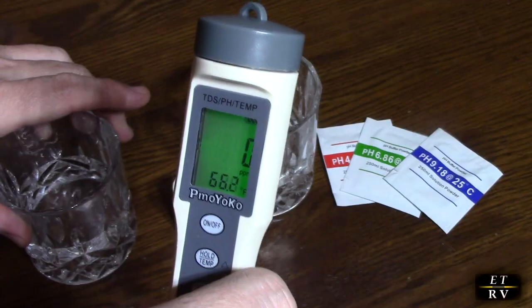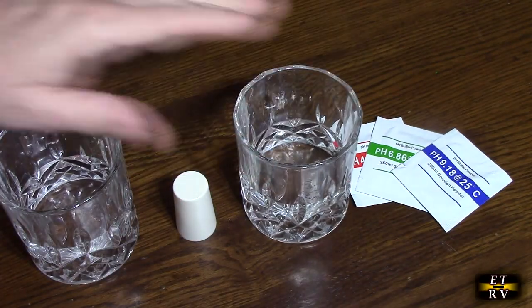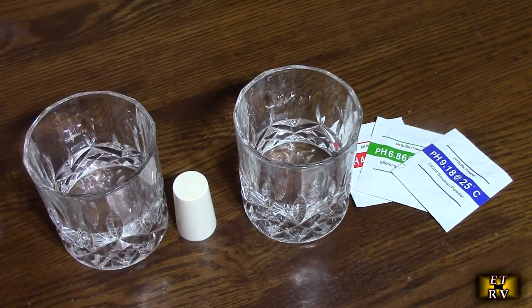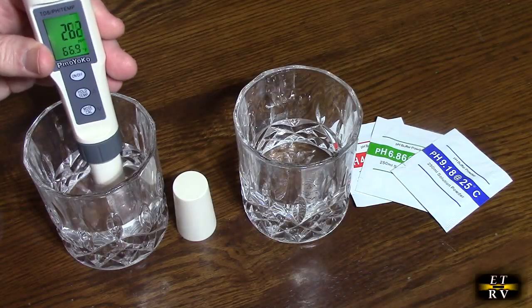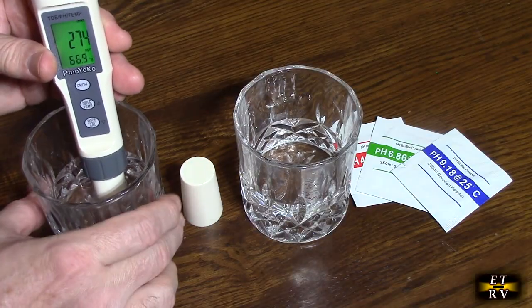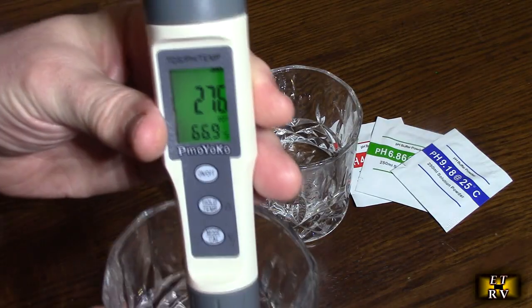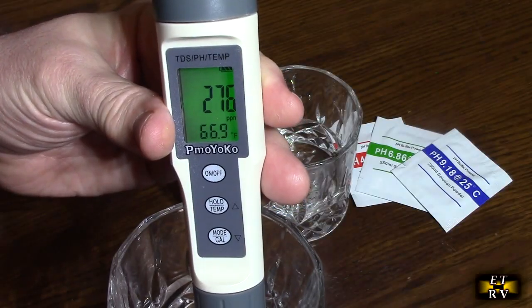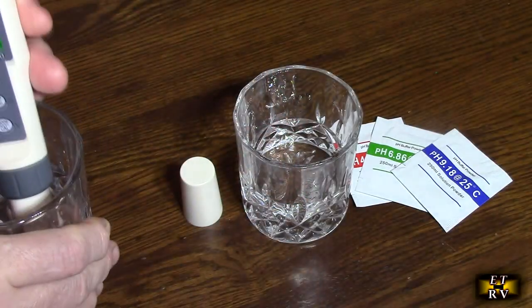We've got two cups. One of these cups was tap water. The other was reverse osmosis water. I lost track, but let's just put that in there. And you can see it's showing me that it is 276 parts per million. So that is the tap water.